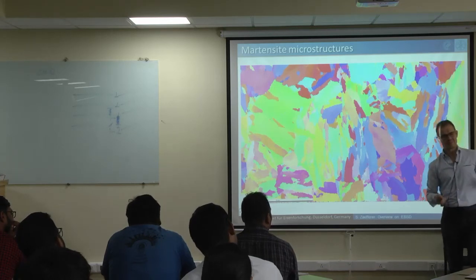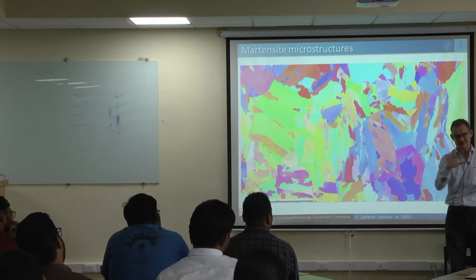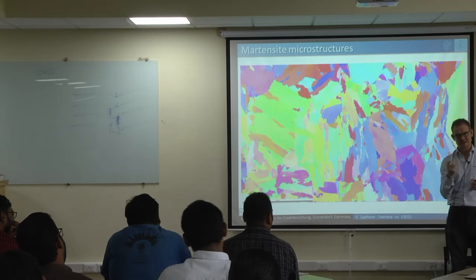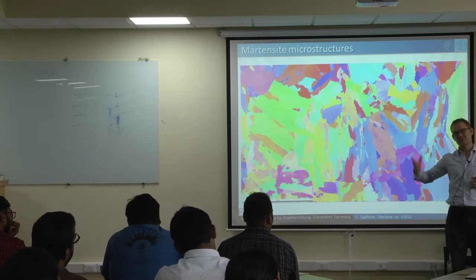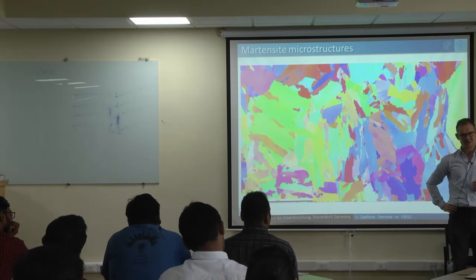But the direct answer, can I tell, is it bainite or ferrite? Is it bainite or martensite? I cannot give you that, because it depends on so many variables, and you should also know at which temperature the transformation happened. And of course, sometimes you need to look, do I see carbides or do I not see carbides, in order to say that.